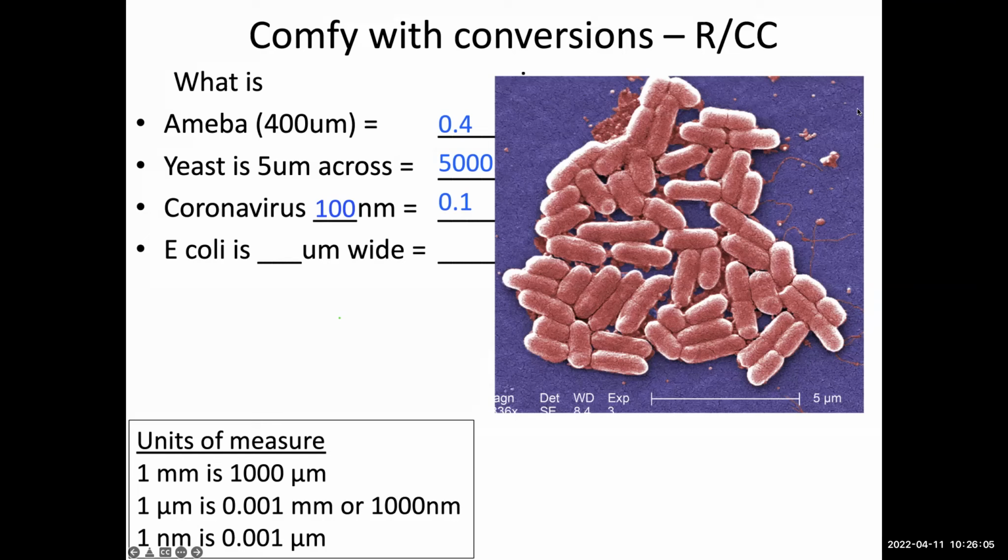I just kind of went with the eyeballing method and tried to count how many widths I thought I could get in there. And I counted about 10. Mm-hmm. So you visually stood them up side by side on this little line. Stood them up using my pinky finger. Yeah. I counted about 10 in there. Yeah. And then you went 5 divided by 10 is 0.5. Yep. Yeah.